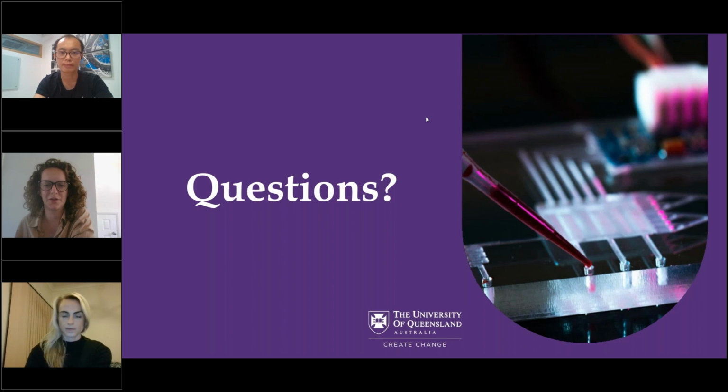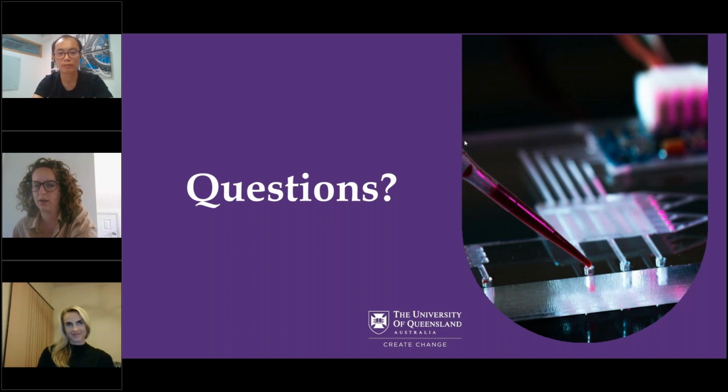Okay, good to know. And then Anna, the amount of fluorostop, or if you use an alternative droplet breaker solution, could you talk about the volume that you added compared to the emulsion volume and if it affected the viability of your cells? That's a really good question.